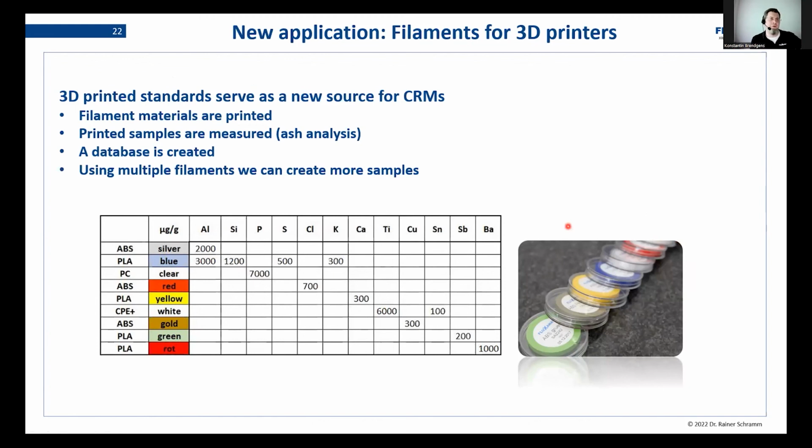I wanted to take a little tour about the 3D printed filaments and the standards that we hope to make from them. The situation we have now is really interesting. We have these filaments, which are extremely good and reproducible polymers, and they are known, they always come in the same quality. So the idea that has arisen, that a lot of people want to pursue right now, is to use these filaments to print CRMs.